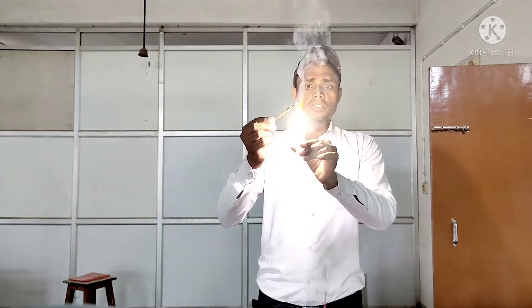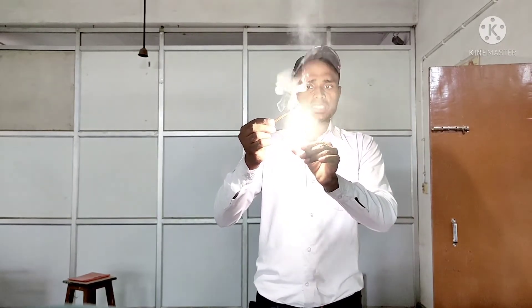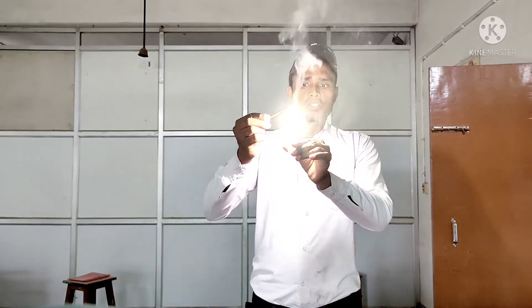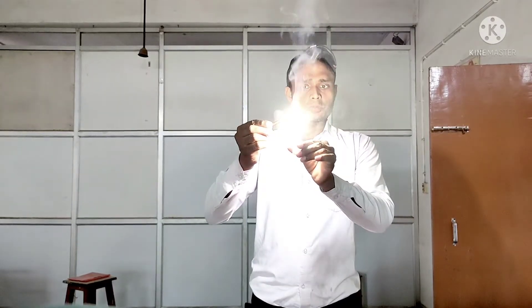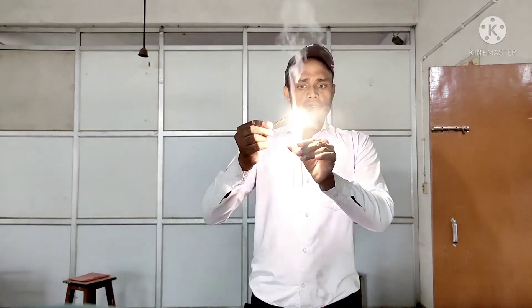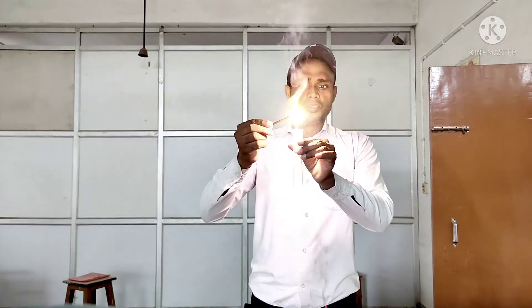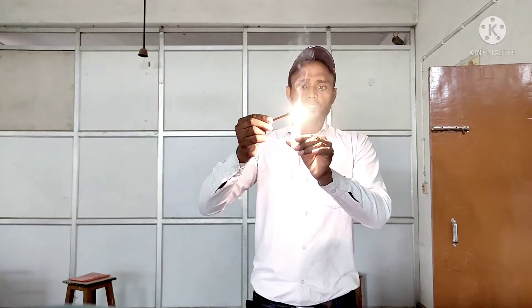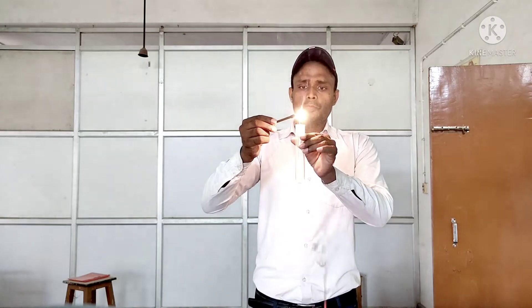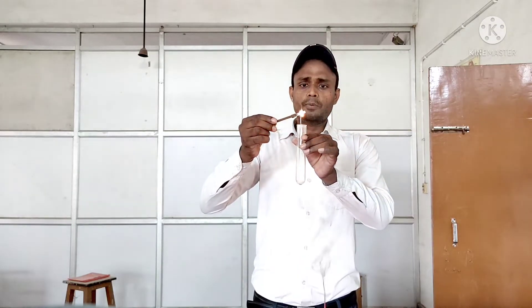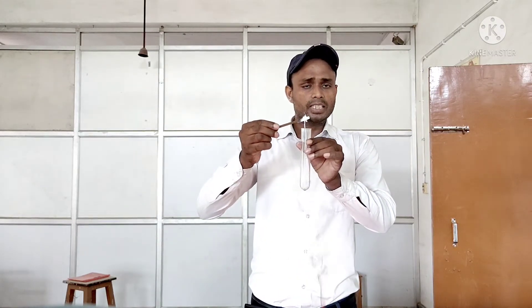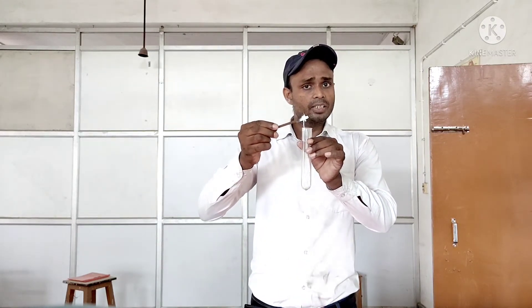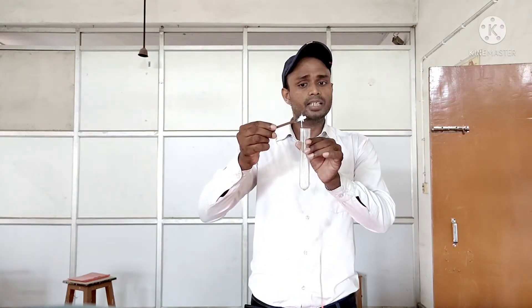The magnesium ribbon burns completely. So what do we get? We get ash. As was explained in the previous video, what is present in this ash? Magnesium oxide.